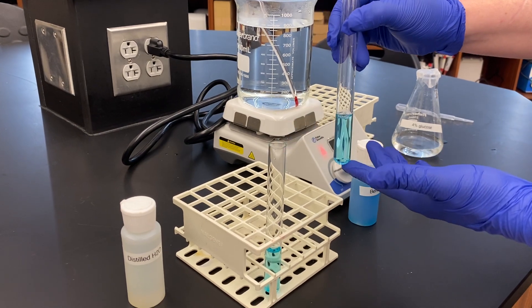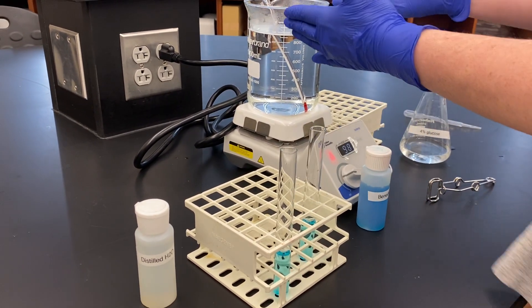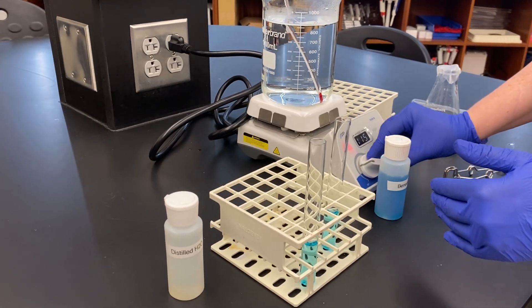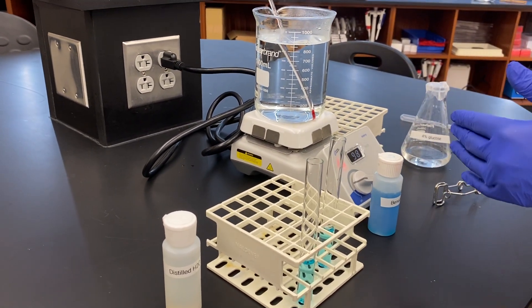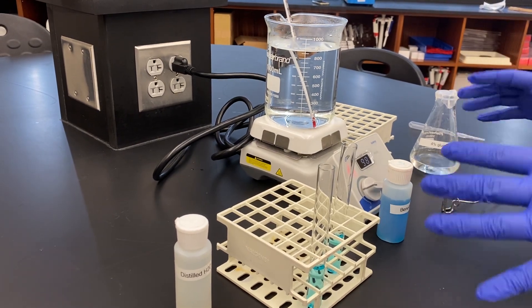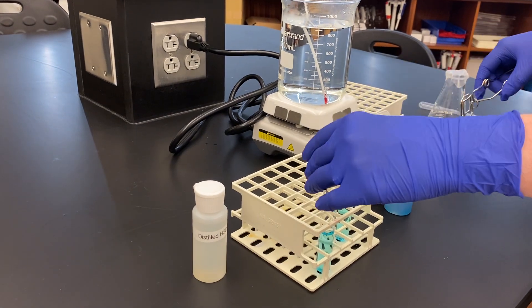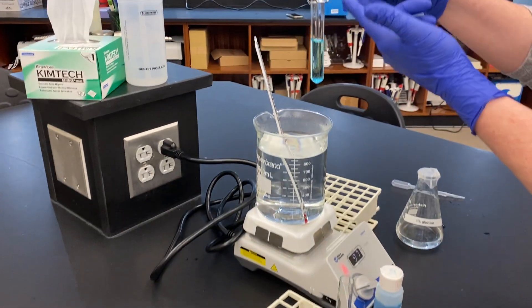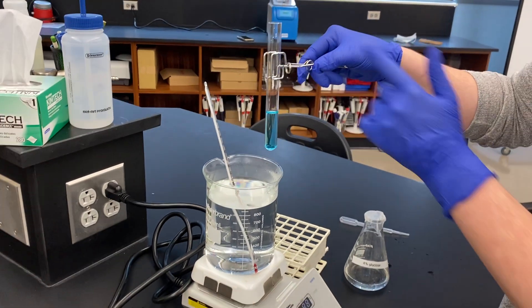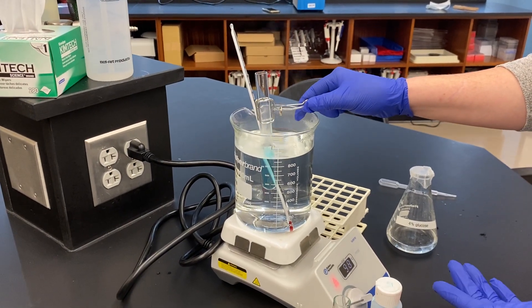This reaction actually needs heat in order to occur. We have our hot plate set to about 100 degrees Celsius — it's not quite there yet, we're about 80 degrees Celsius, which is about where we want to be for this reaction. Anywhere between 80 and 100 should be sufficient. We'll put our test tube on a test tube holder and stick it in there for three to five minutes.